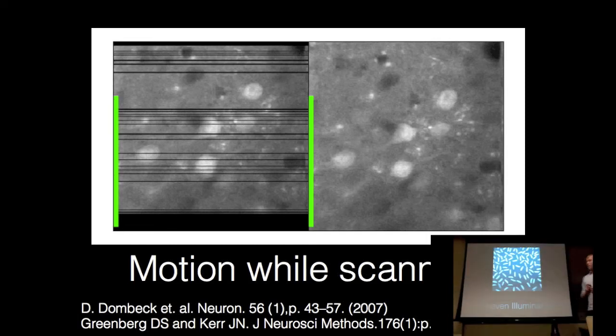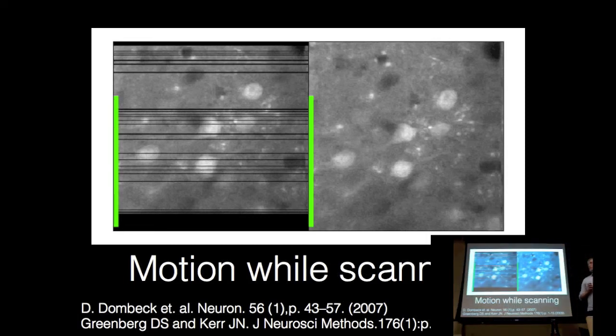Okay. Question. I think this is a solution for the moving of the X and Y axis. So what about the Z? The Z problem, you could take a similar approach to try to predict. Essentially what you're doing is saying, okay, where did this line of data actually come from? And let's put it back where it belongs. If you were going to do the same thing in Z, you could do that.